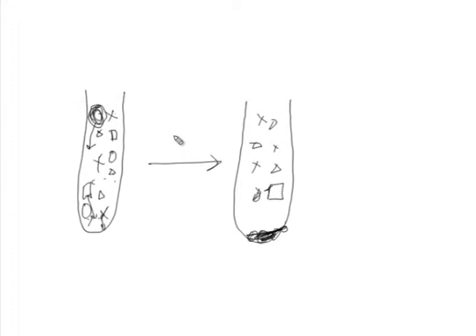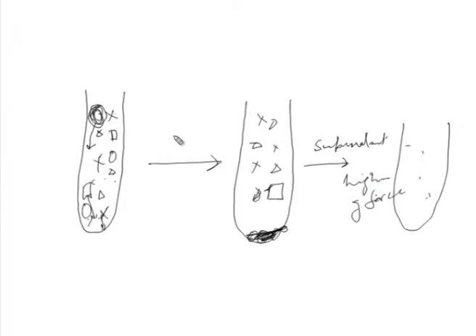So, now what is happening? To purify, what is done is you take the supernatant and decant it into the next tube, and the centrifugation is done again at a higher G force, say 10,000 G or whatever it is. Likewise, you take this pellet and homogenize it again in a suitable medium.